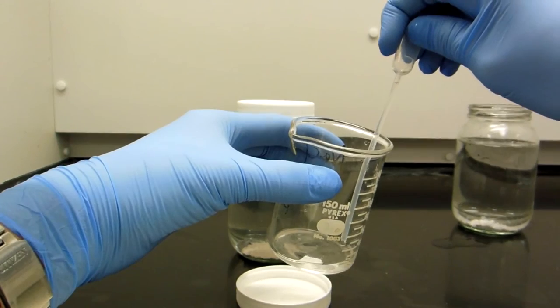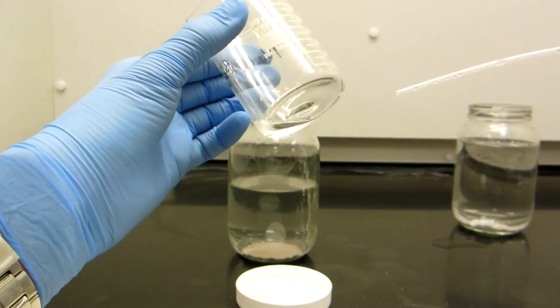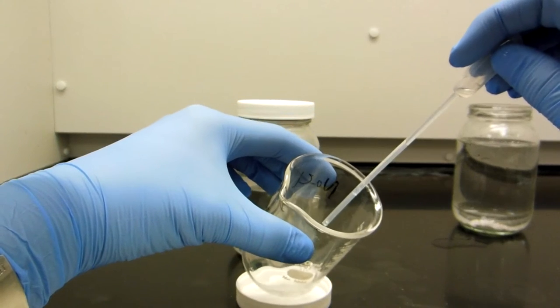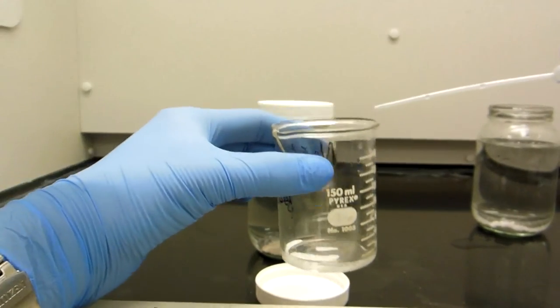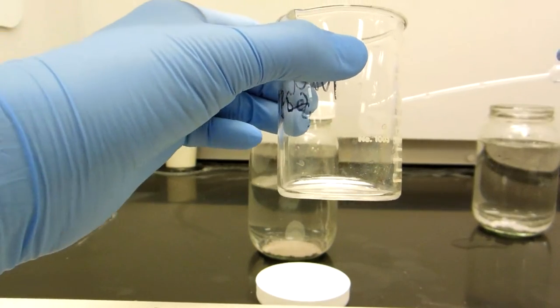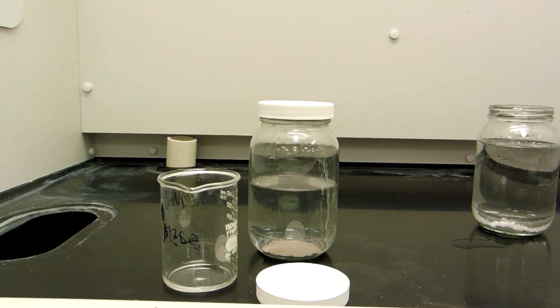Now this is to test for any additional silver chloride that I may have missed. And the solution remains clear with no more precipitate forming, which means there's no more possible silver left in the jar that isn't dropped. So this shows that I put enough sodium chloride into the solution and have dropped out the silver chloride. I don't need to check the other one as it's kind of like a quality check type thing, showing the other one should be clean as well. So that's this step. So I'll move on to the next.